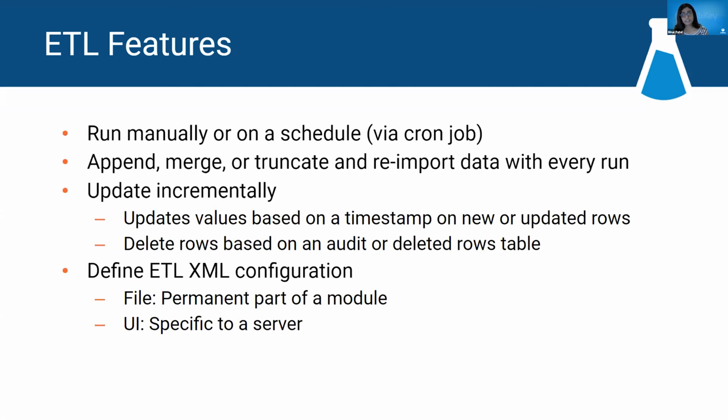You can also set the ETL to update incrementally. These updates are based on a timestamp. The timestamp needs to be there in the external tables, and we store the timestamp of the last ETL run in LabKey. Then the comparison happens between the two, and if the timestamp in the external table is later than the last ETL run, then it is time to update that row. You can also delete rows in LabKey based on an audit or deleted rows table that probably exists in the external database.